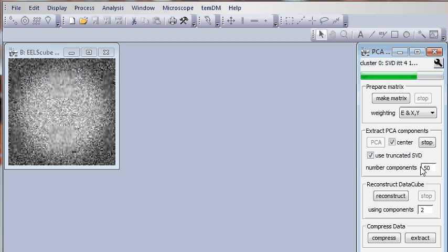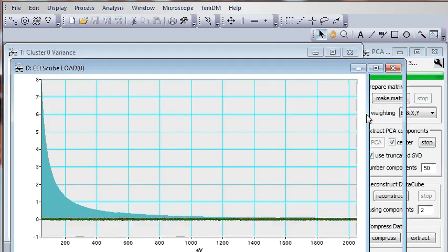It's very quick and precise for the most major components, but for higher index components, NIPALS can be rather slow. Thus, it's a good time to switch to SVD, which extracts at once a large number of components, like we do right now. So we're approaching the end.